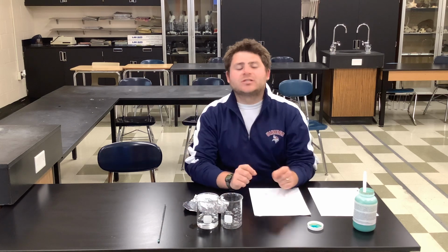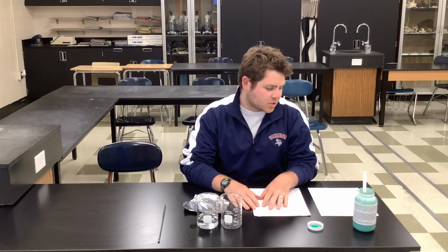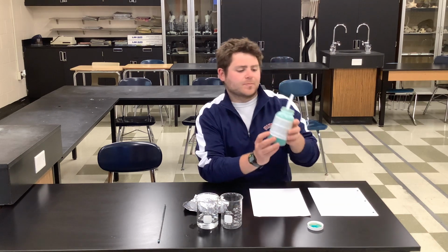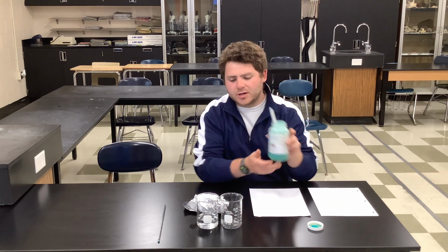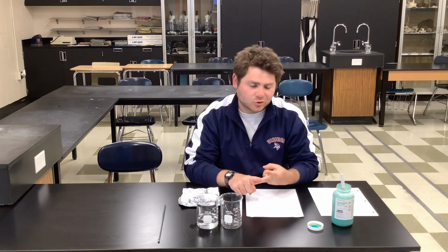Hello guys, so today in class we're going to be doing the copper chloride lab. How that works is we're going to be using this chemical called copper chloride. We're going to be using some aluminum foil, some water, but before we do that, I want to explain the difference between physical changes and chemical changes.